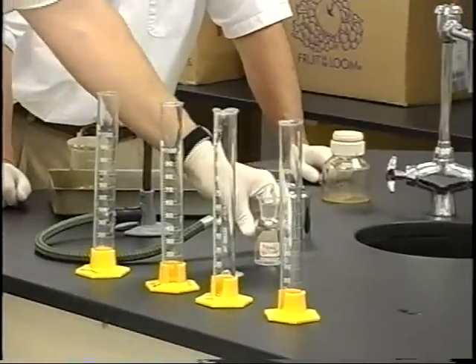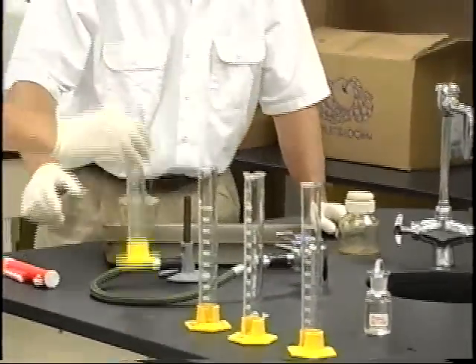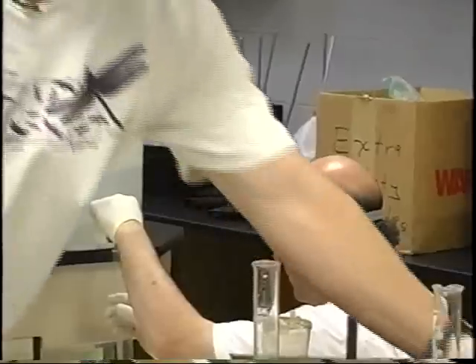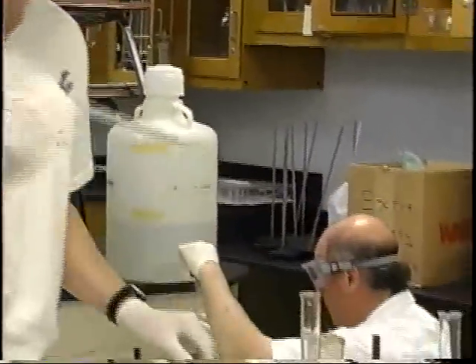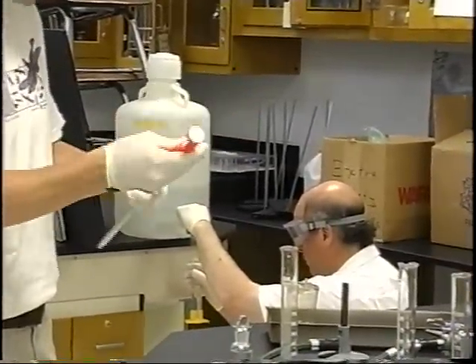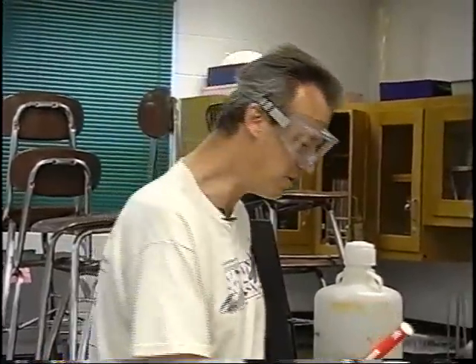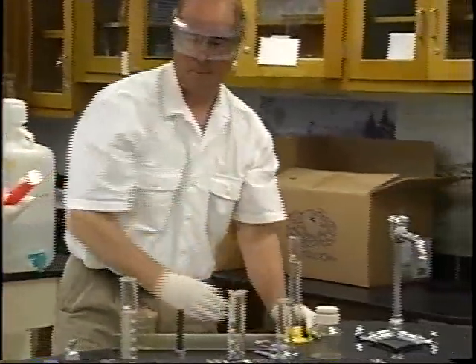So step 1, we're going to have our able-bodied assistant get us 99 mLs of deionized water. While he's doing that, I'll take our river sample. You get to use the cool high-tech pipette device, which I know you've practiced in class. You need to get 11 mLs of water out of here. So we're preparing 110 mLs of water, 99 of deionized, 11 from the river.